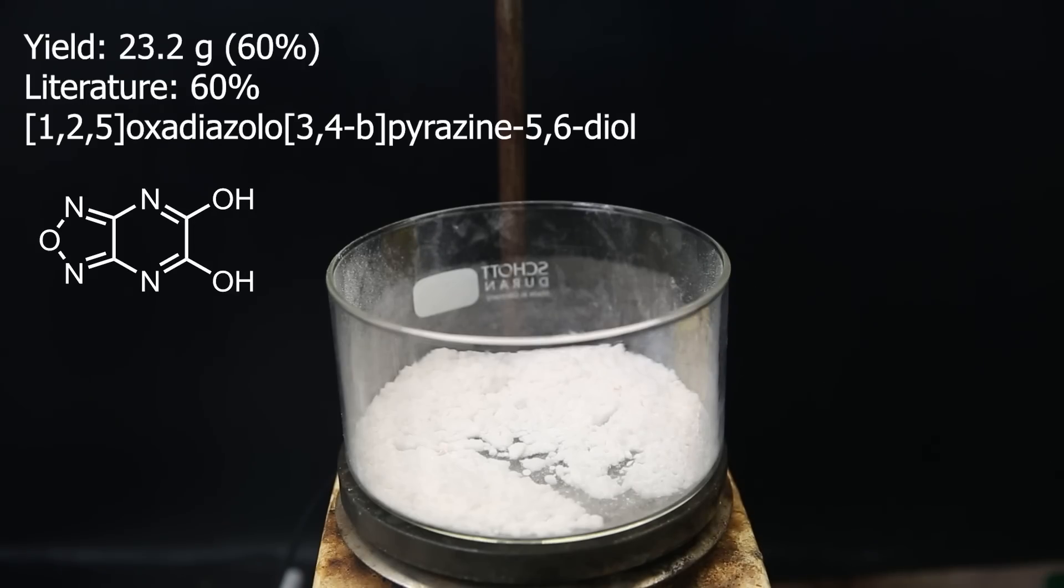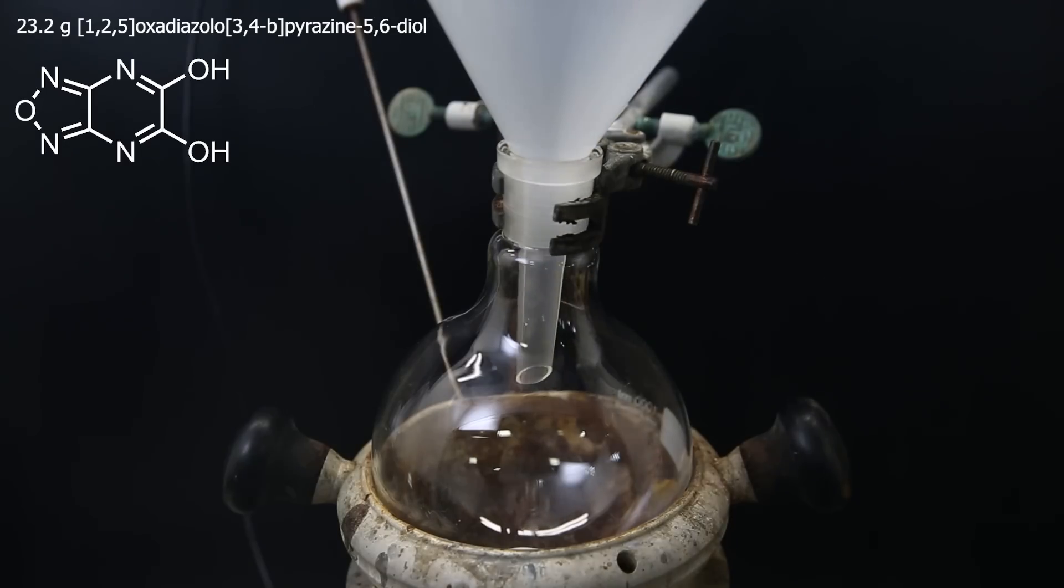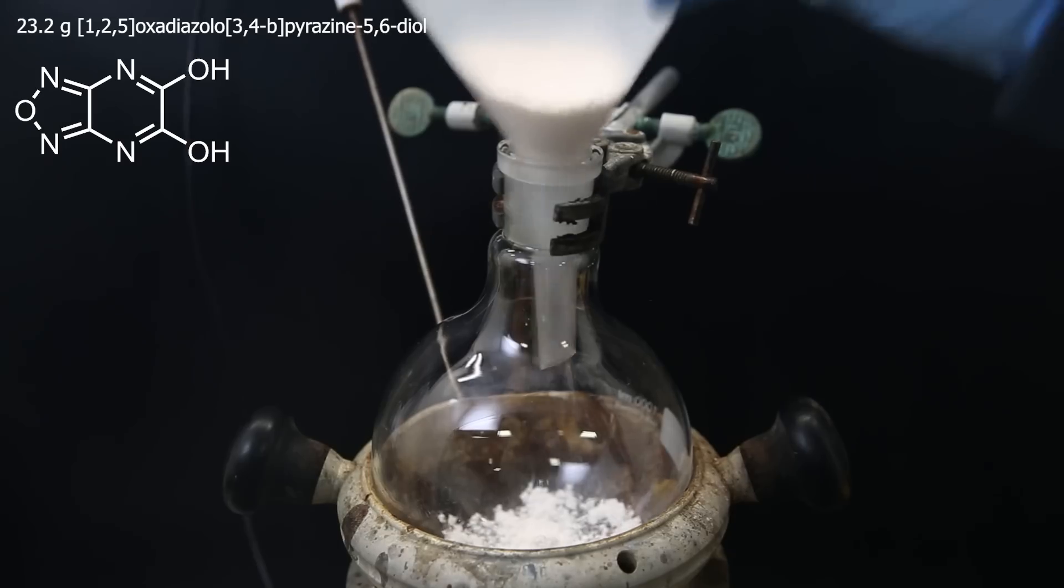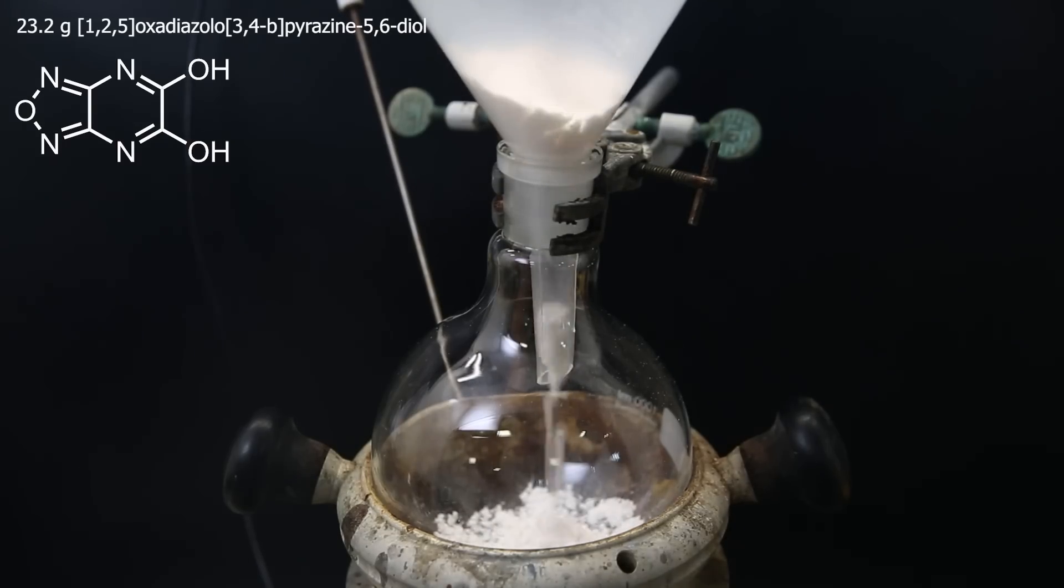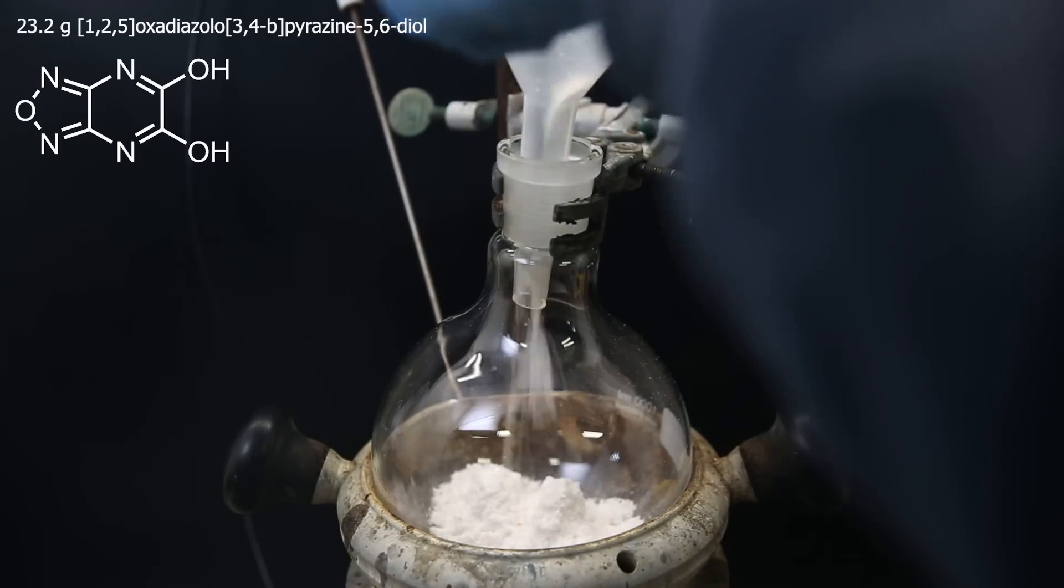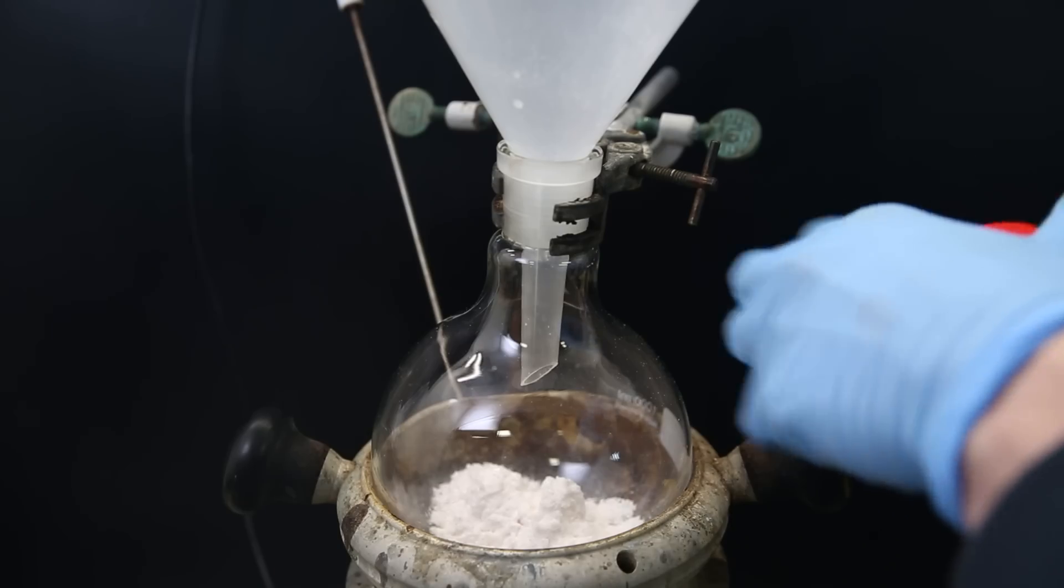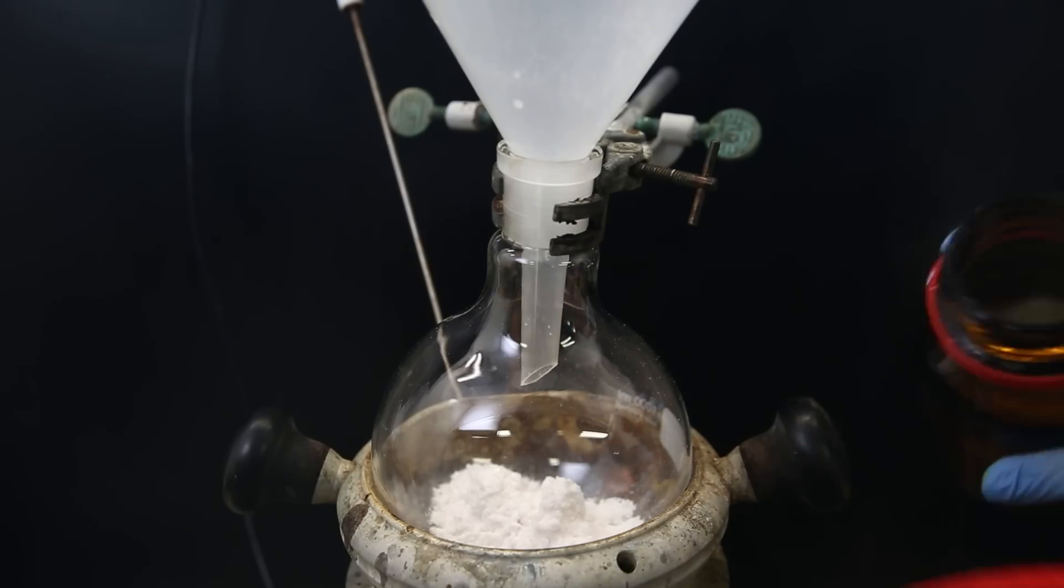Moving on to the next step, I have to replace the hydroxyl groups with chlorine, so I move all of the materials into a large flask in a heating block. There are many different ways to replace alcohols with chlorines, but here they specifically use a mixture of phosphoryl chloride and phosphorus pentachloride, so I guess I'll have to do that too.